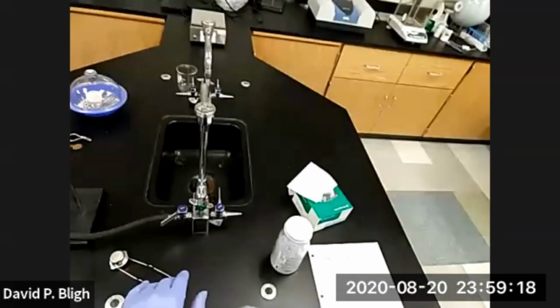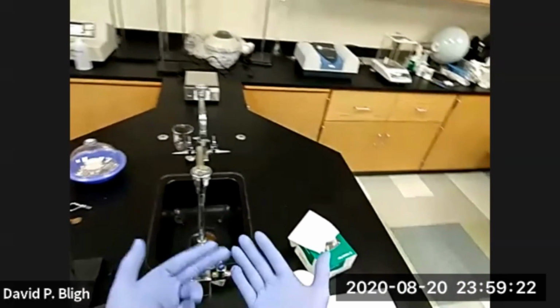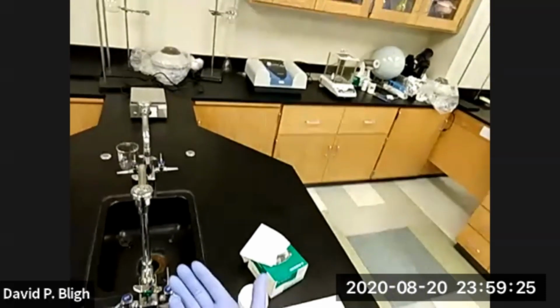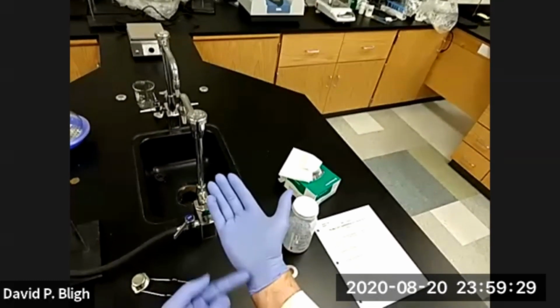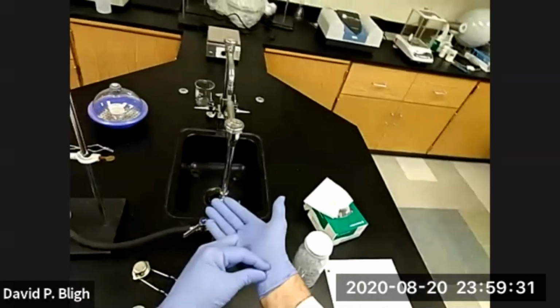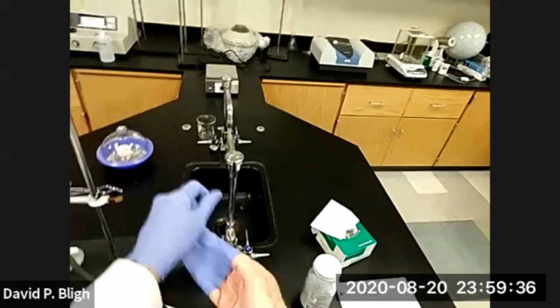Well, there's a procedure, right? You want to turn the glove inside out so that the contamination is on the inside of the glove when you throw it away. So you grab one here, not against your skin, because this may be contaminated. So you grab it here, pull it off like that.